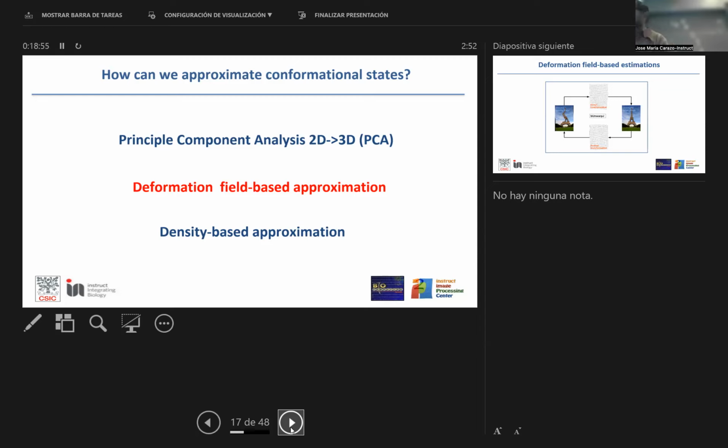So it's a deformation field. And you will see at the end that this is especially important because with this deformation field, we have been able to do a reconstruction algorithm that takes into account the deformation field and deforms each of the images and is able to increase the resolution, the local resolution in moving blurred areas.